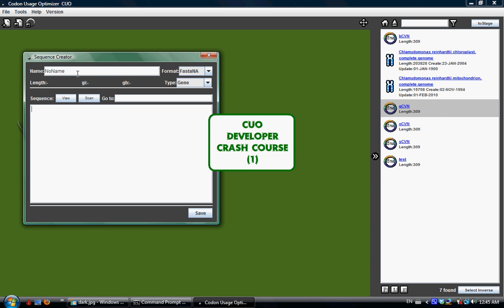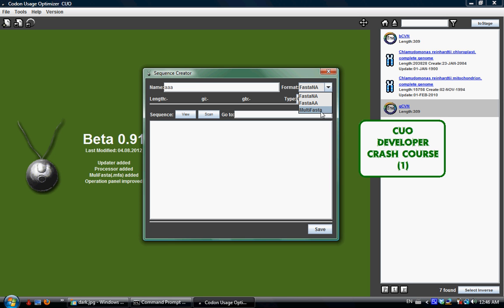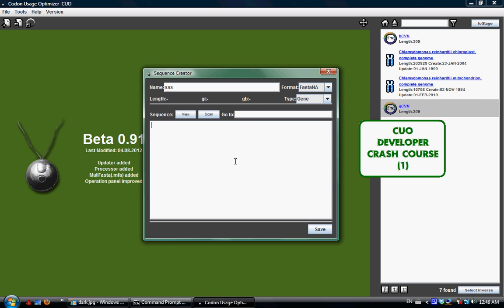Here is the name, you put your name of your sequence, I'll put just AAA. The format here indicates the type of file you want to create. Fasta NA is a fasta nucleic acid file, fasta AA is the fasta amino acid file, and multi-fasta is multiple instances of fasta NA file stacked into one. It's a much more organized form of a lot of fasta NA fragments. So I will create some sequence here.